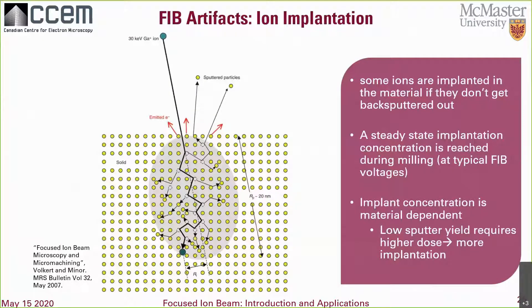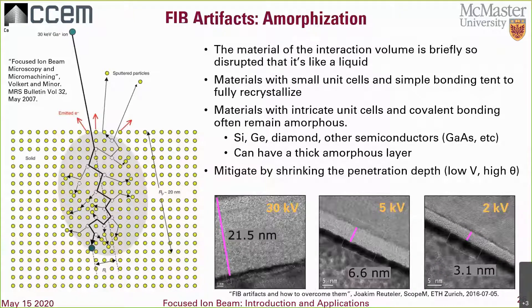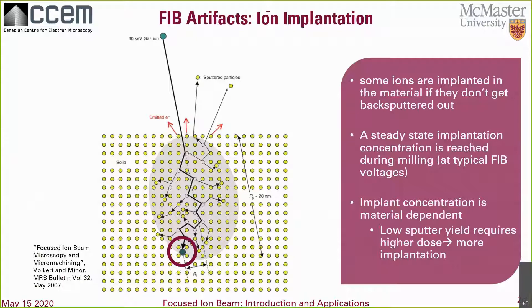Now some damage artifacts from FIB. First, ion implantation — a consequence of high energy ion beams interacting with material. Some ions are implanted and remain in the material if they don't get back sputtered out. During milling, a steady state of ion implantation is reached because as more ions implant, the material continuously disappears due to sputtering. The amount is material dependent and inversely proportional to the sputtering yield — materials that mill slowly require a higher dose and end up with a higher concentration of implanted ions. So in spectroscopy you'd see a higher concentration of gallium in something slow-milling like steel compared to something fast-milling like copper.